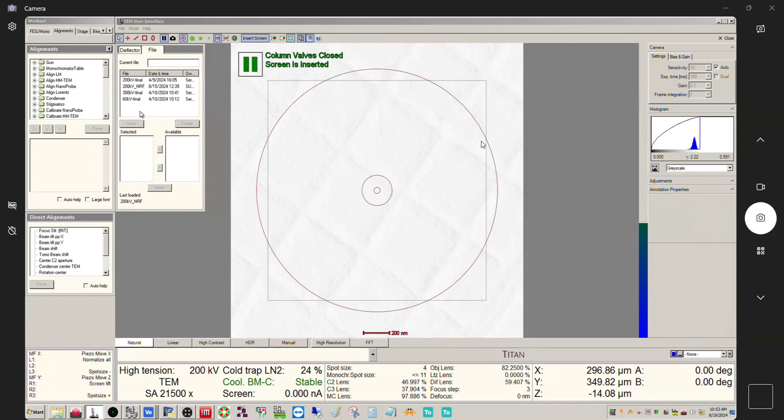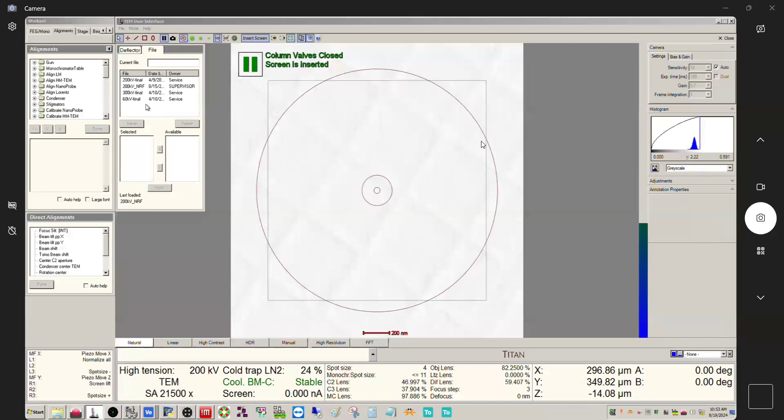In order to actually modify, save or delete an alignment file, you have to be logged in as either supervisor or higher level than that. You can actually see over here it has owners for these files. The one that we've been working on, 200kV underscore nrf, was saved at the supervisor level. These other three were done at the service level.